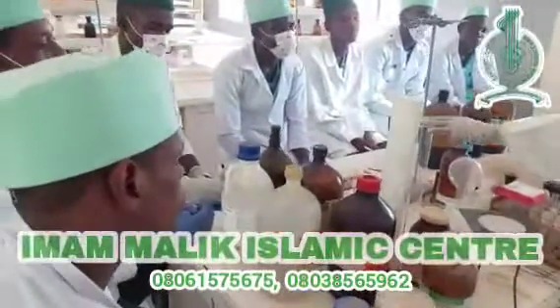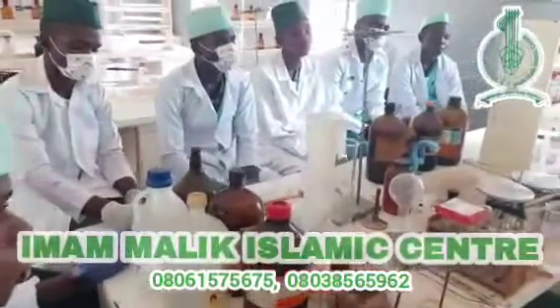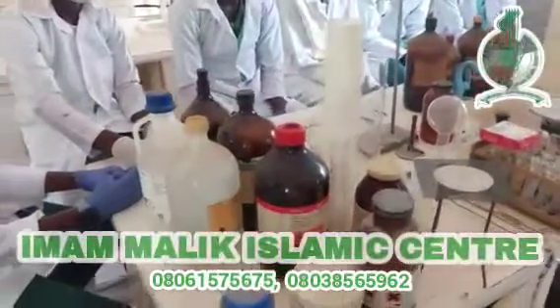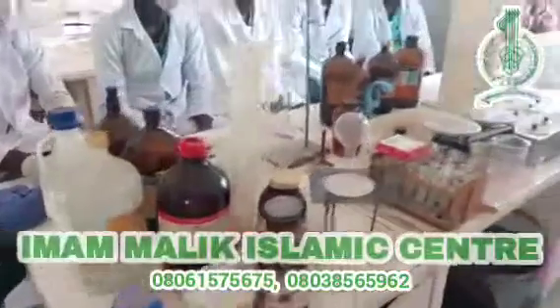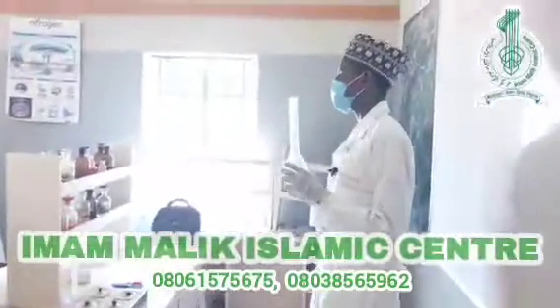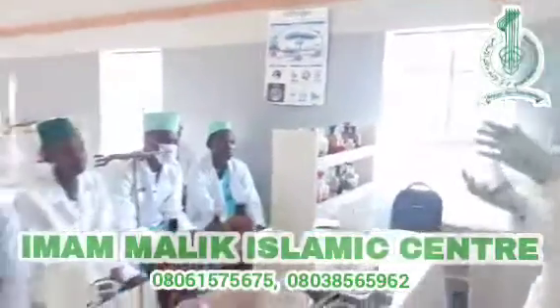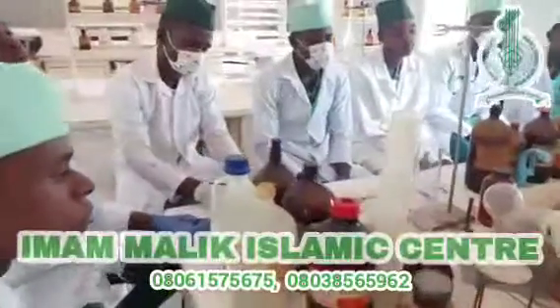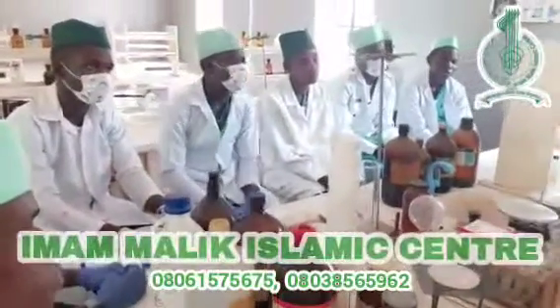As we have said earlier, in the case of the measuring cylinder, you just use it for measuring. You cannot prepare solution inside a measuring cylinder. But with this one, you can prepare different solutions with accuracy in the case of the volume. So this is called a volumetric flask.